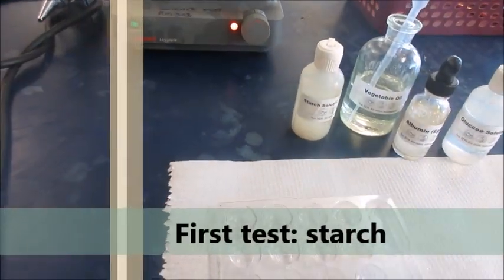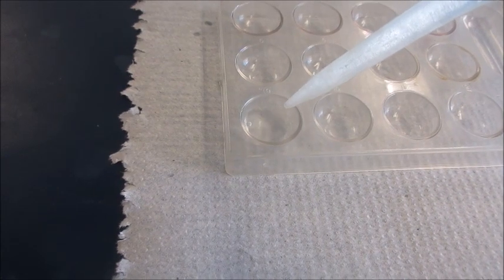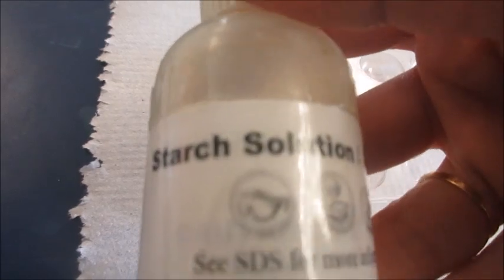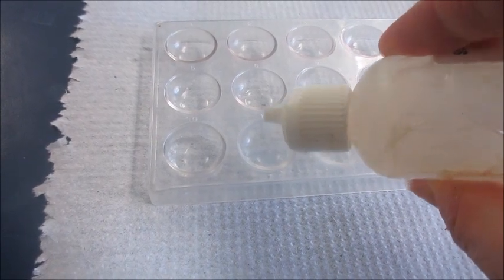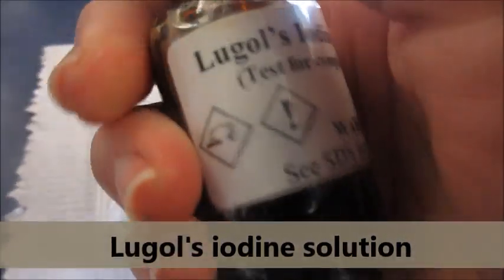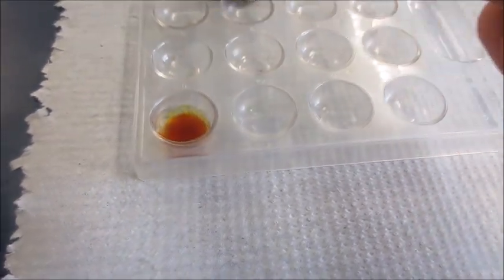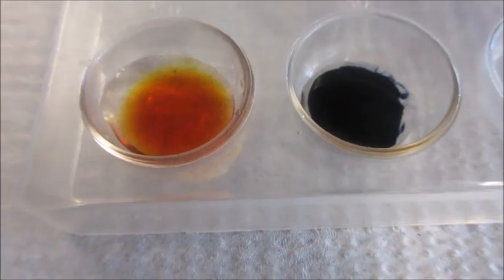For the first test, we will be testing five drops of water. Place five drops of water into one of the wells of the spot plate, and place five drops of the starch solution into the other well. Then add two drops of Lugol's iodine solution. First we test water as the control, and now we test for the starch. It gives you a blue-black color.